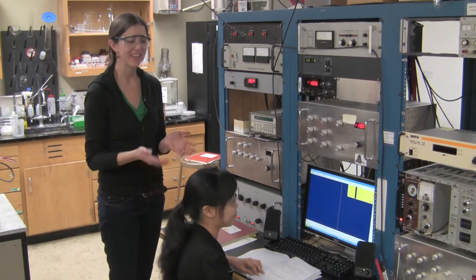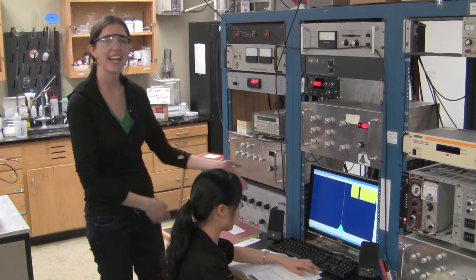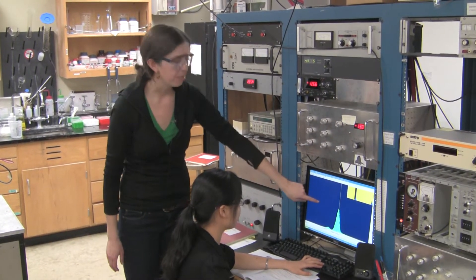So this is Shu Yun, she's helping me on the amyloid beta Alzheimer's disease project and she's taking an ATD here, an ion mobility experiment. And you can see two peaks here.